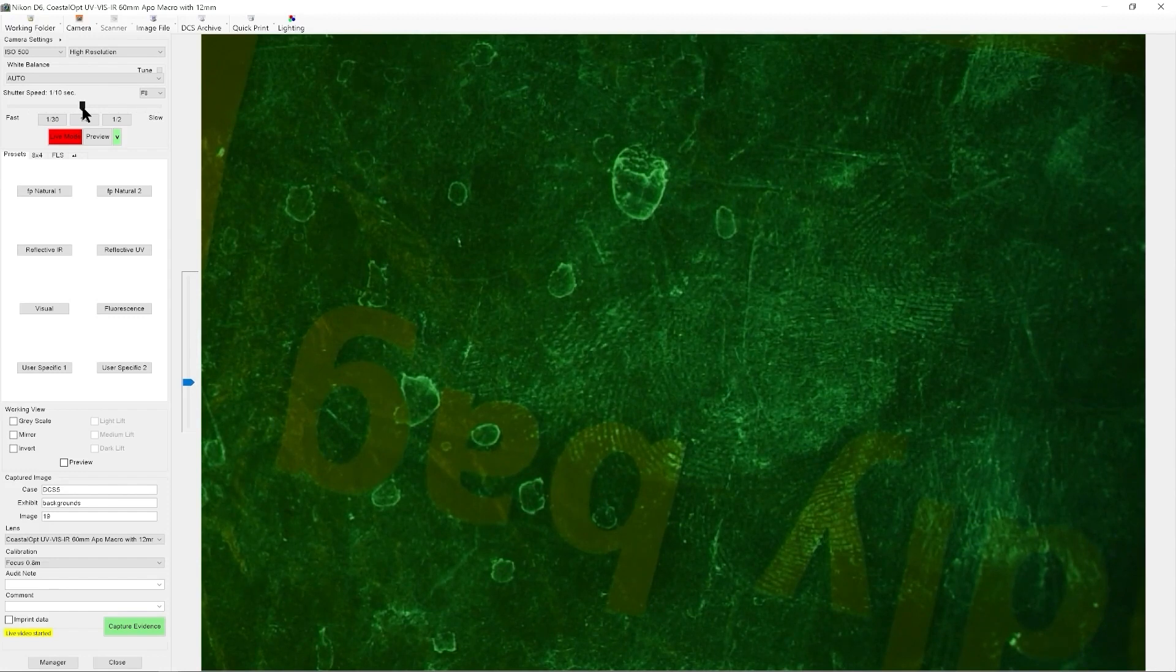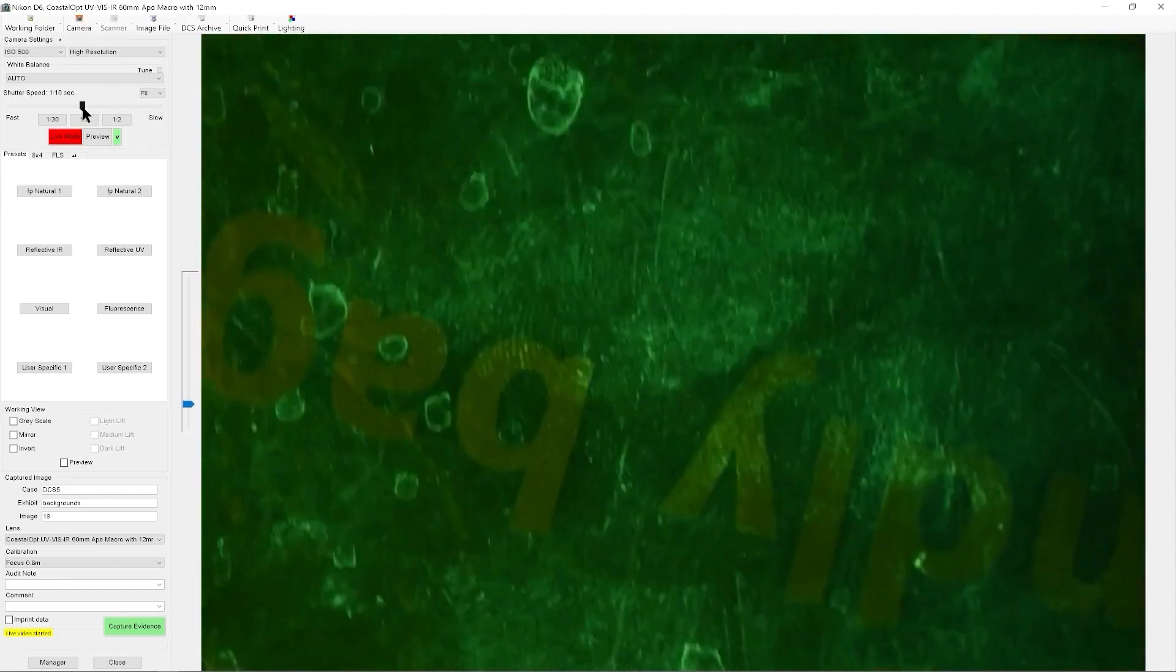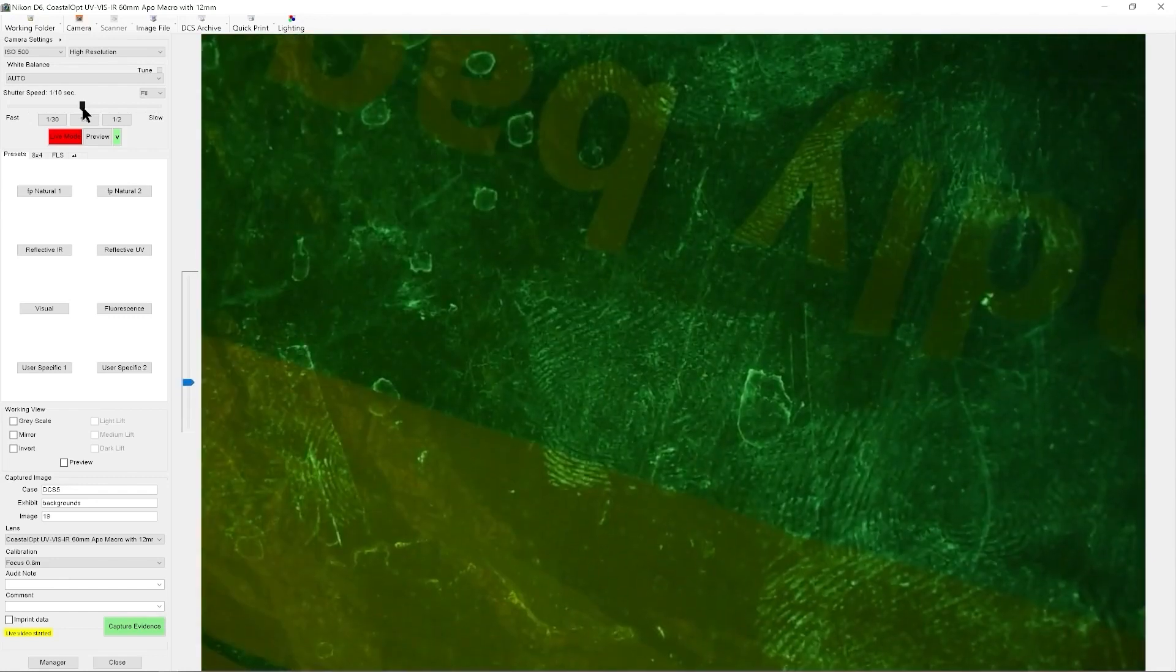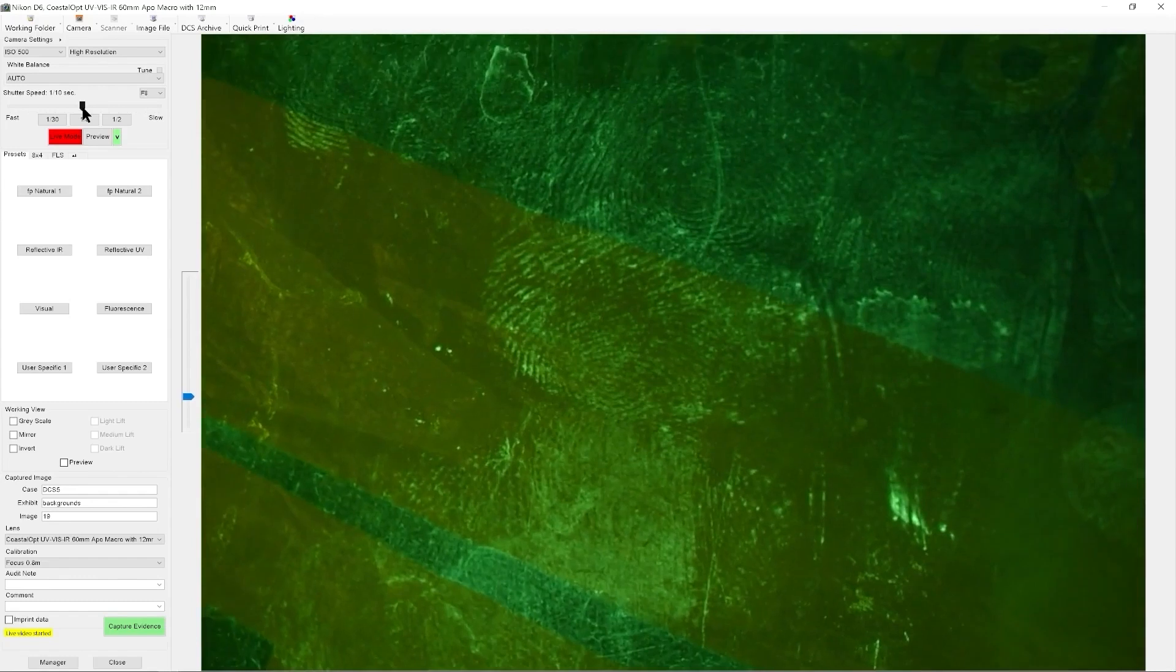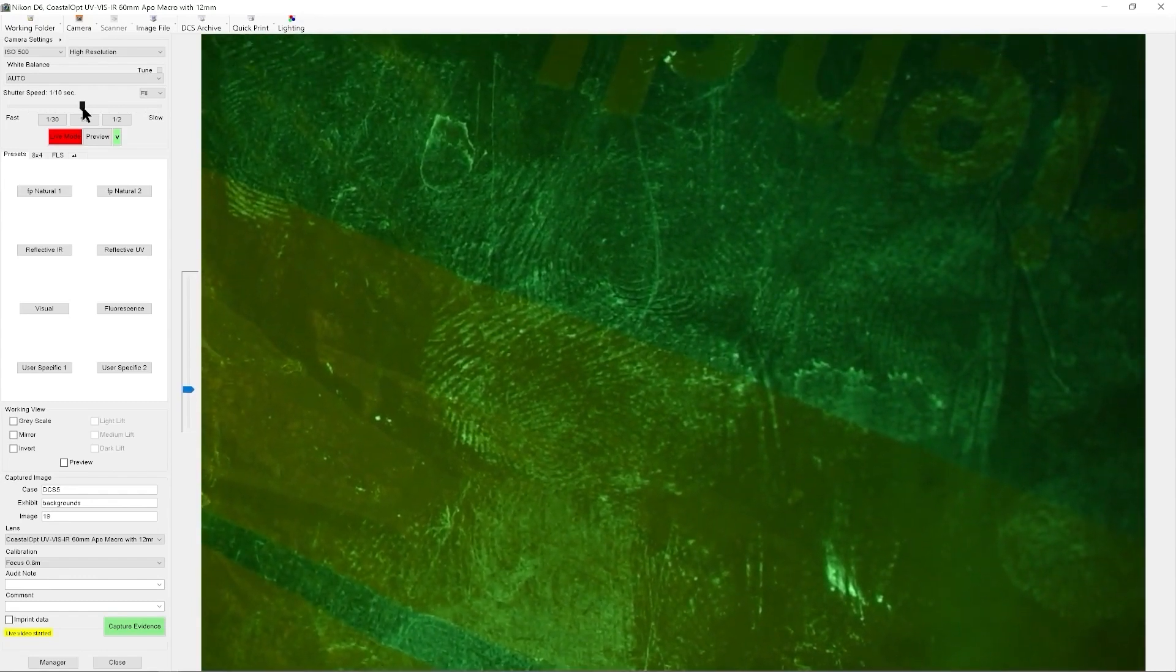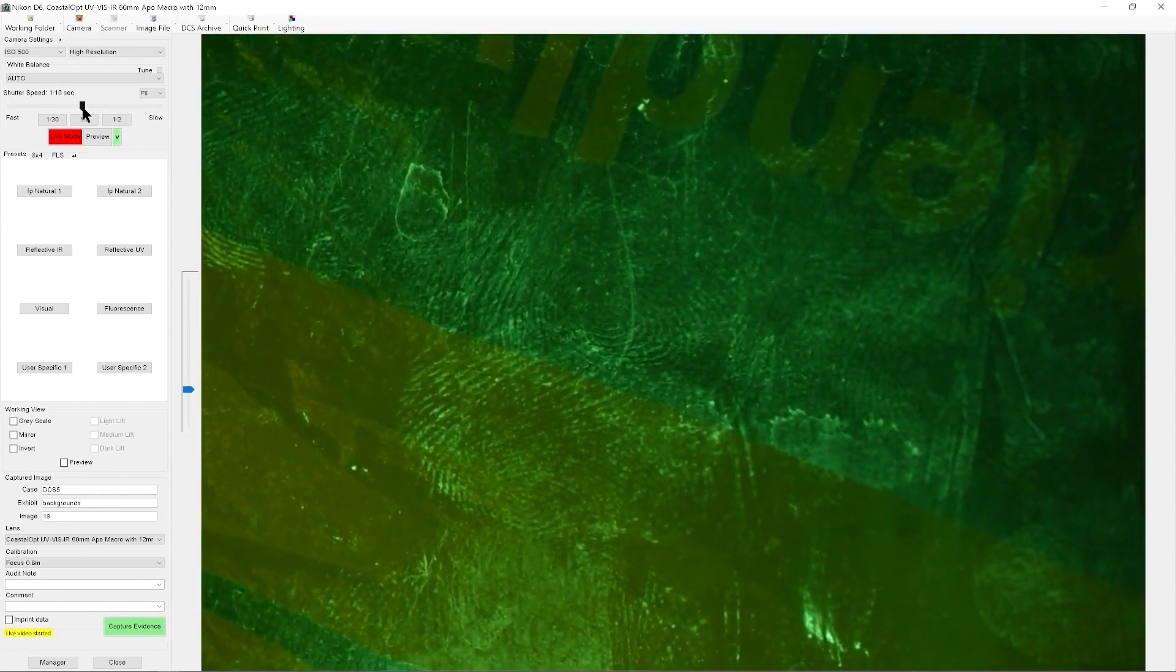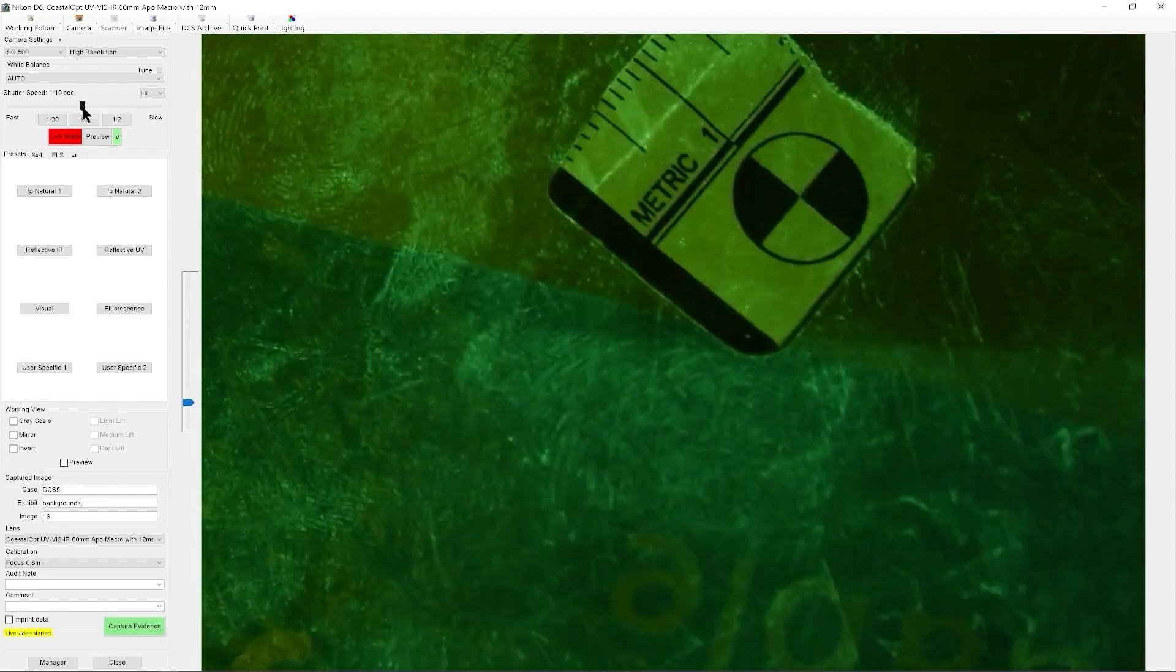But that of course is actually in black and white as opposed to in colour. So if we move this around, we can actually see that we have lots of fingerprints here. Using this as a light source for searching.